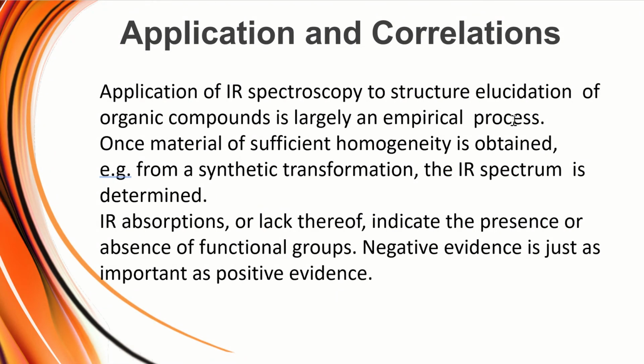Once material of sufficient homogeneity is obtained, for example from a synthetic transformation, the IR spectrum is determined. IR absorptions or lack thereof indicate the presence or absence of functional groups. Negative evidence is just as important as positive evidence.